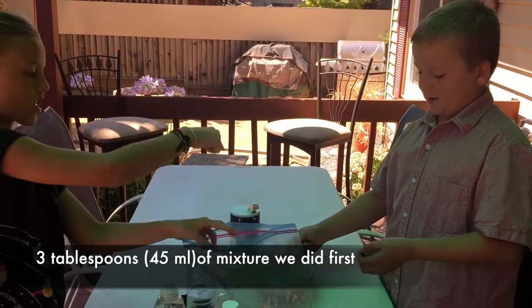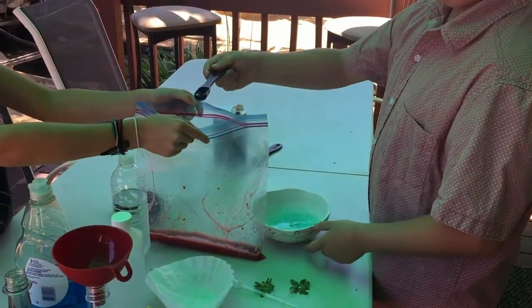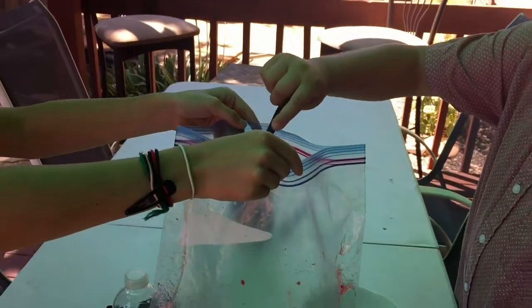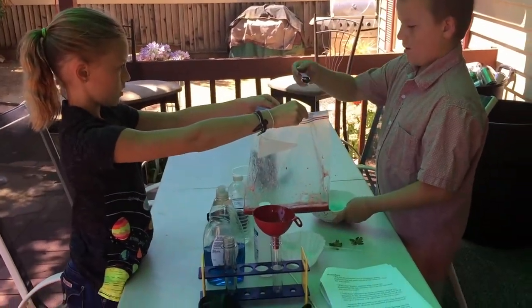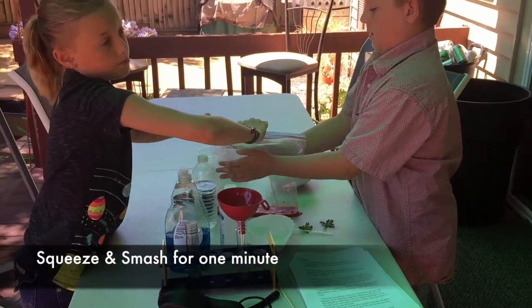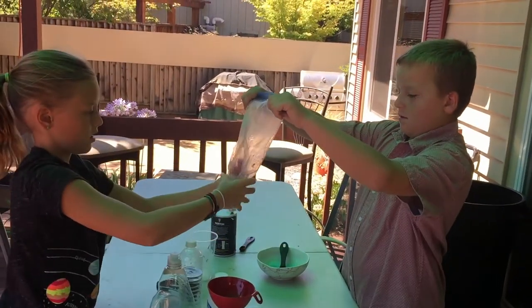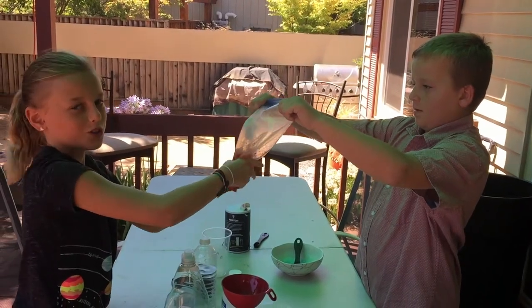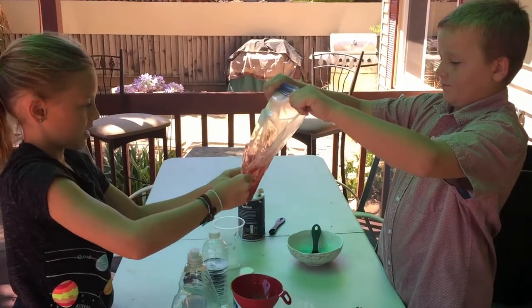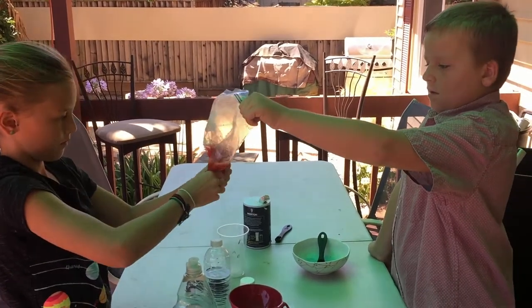Now we are going to be putting three tablespoons of the extraction liquid we made earlier into the bag. There's one, two, and three. After we get the air out of the bag, how long are we going to squeeze it? One minute. We'll let you do that for a minute, and then we're getting ready to filter out all the excess strawberry.